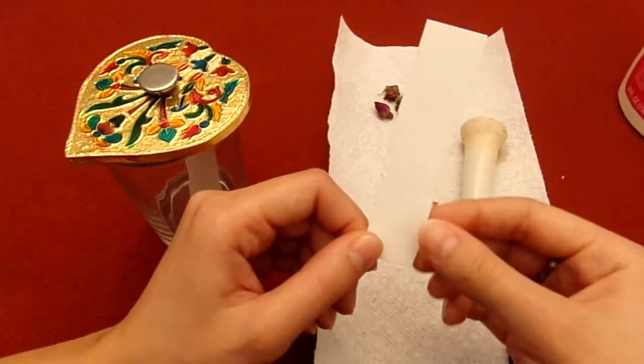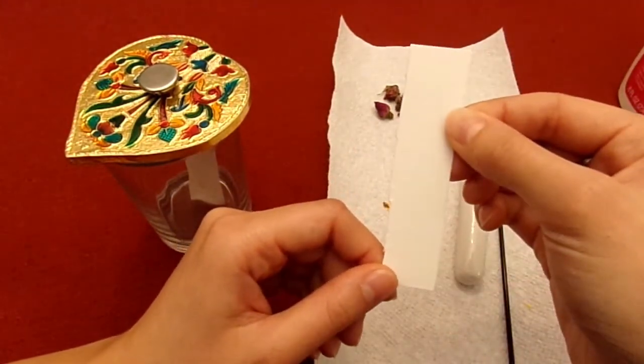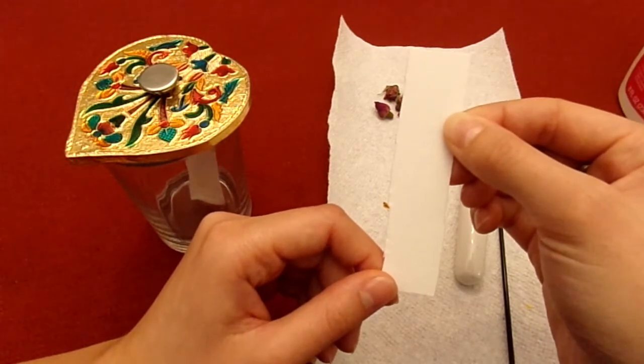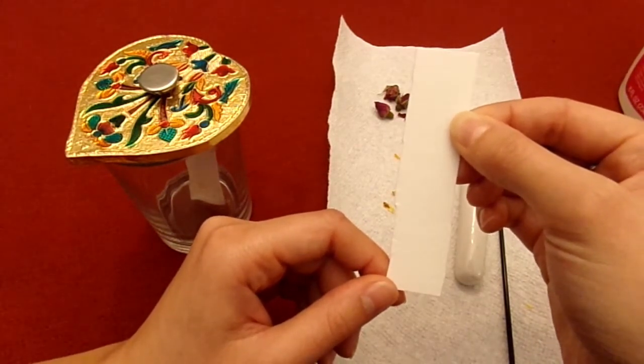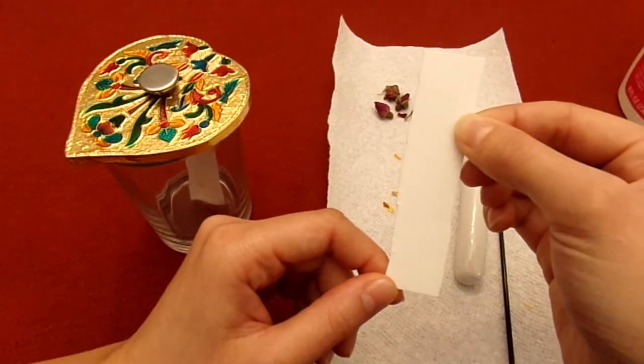Wait for the acetone to travel about three-fourths of the way up the paper. This should take about 10 minutes. Then take the paper out and let it dry and record what pigments you see.